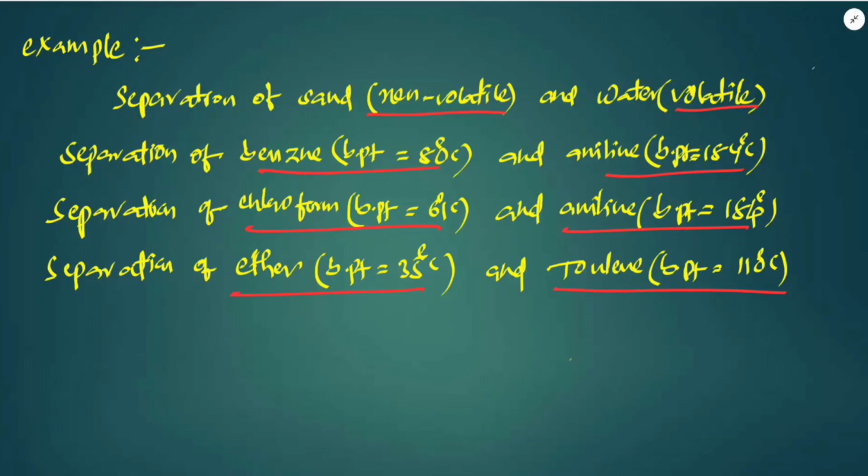The nitrobenzene prepared in the laboratory can also be purified by the distillation process.